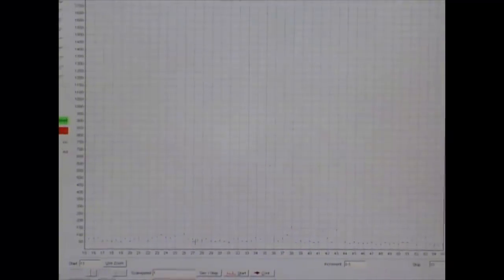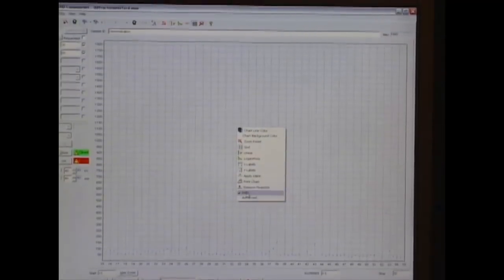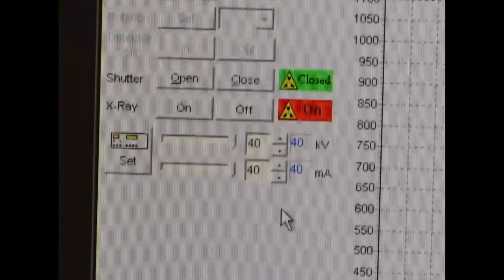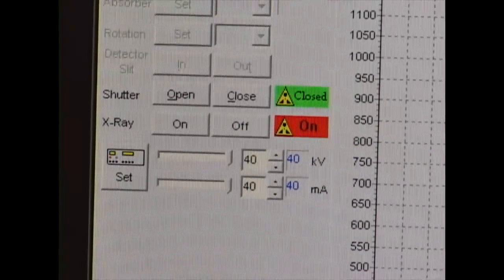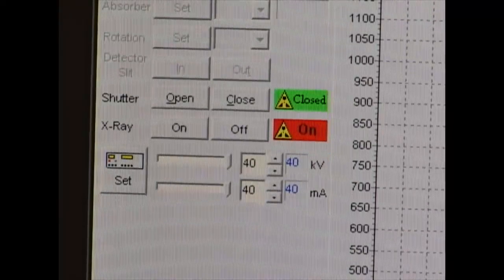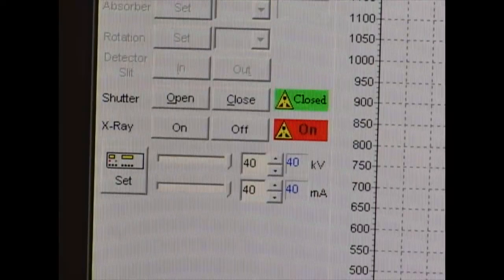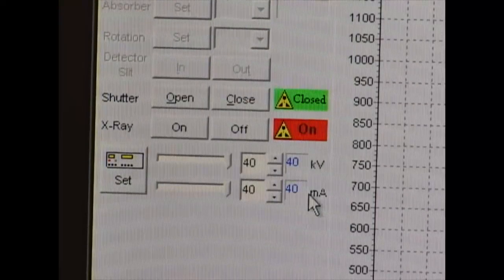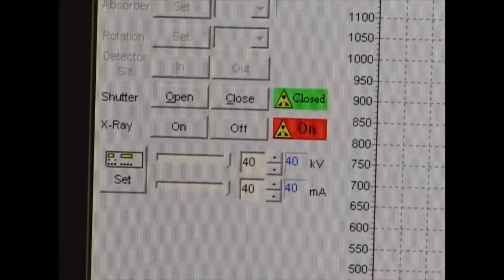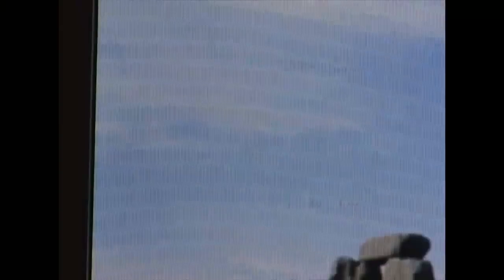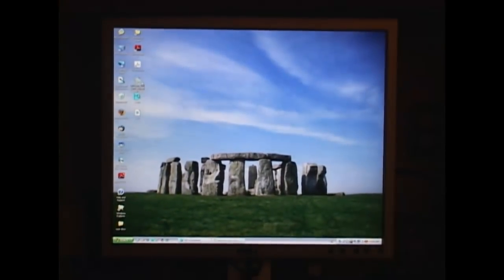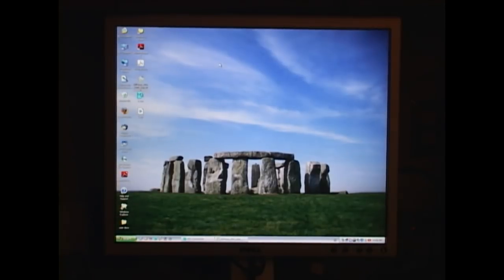So that click indicates that it's finished. Back to dots. The shutter is now open, closed, which means you can open the door. And the power is still on and it's still at 40 and 40. It is not necessary to ramp the power down when you're finished. We want to be able to keep it up if someone's right behind you. It's better for it to stay up than it is to go up and down. But if no one is using it for the rest of the day, we do want it to go into standby mode. So we just leave this open and leave it like it is. You can minimize it. Get your data out of your scans. Make sure that you remember to fill in the log and you may remove your sample and you've finished your scan.